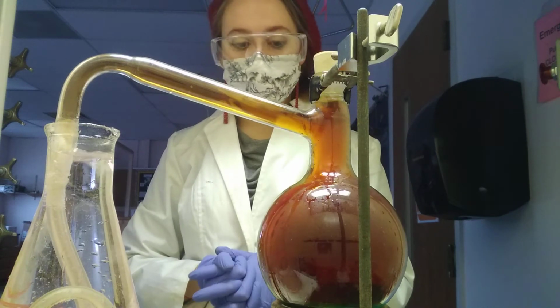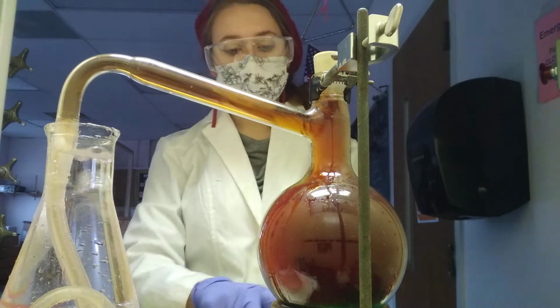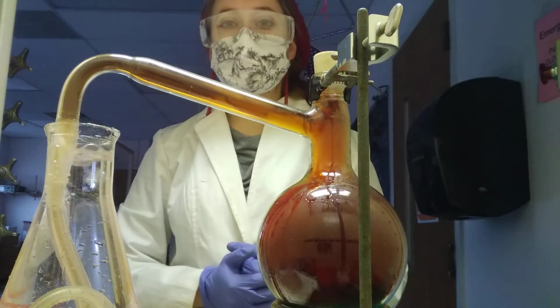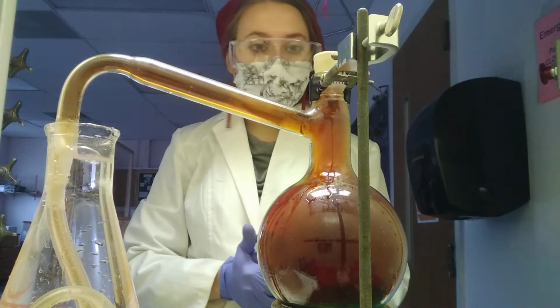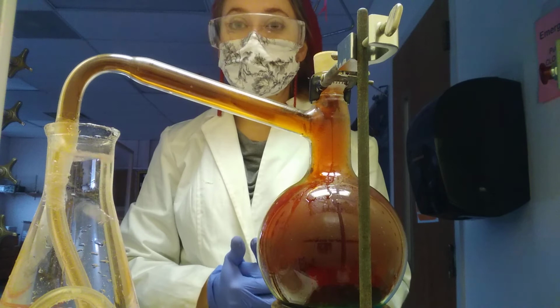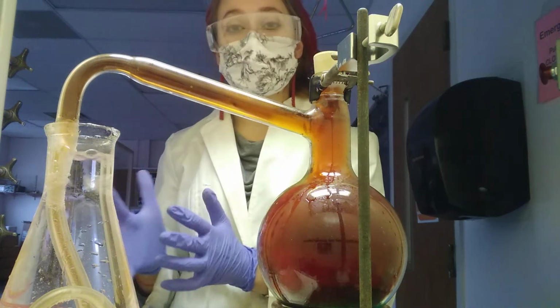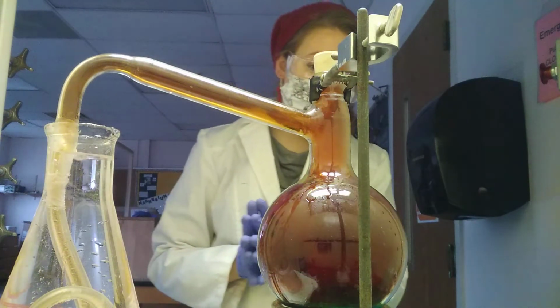going through the hose. It's almost out of your camera view, but you might notice at the very bottom of the flask right here, it's a little bit greenish. So that is the copper nitrate that's forming. Nitric acid is reacting with the copper and it forms copper nitrate. So that is one of the types of reactions we're going to look at today.